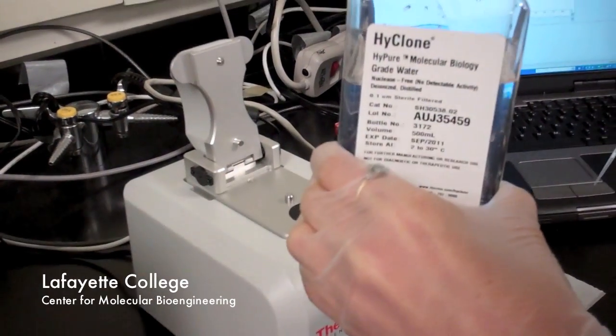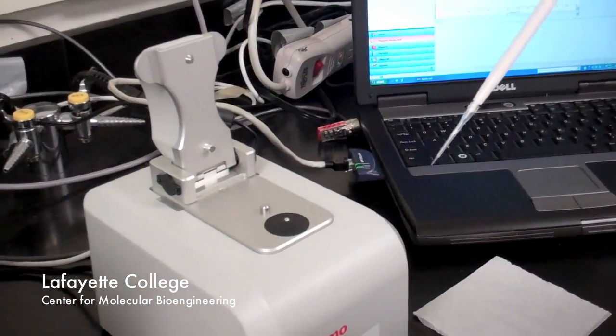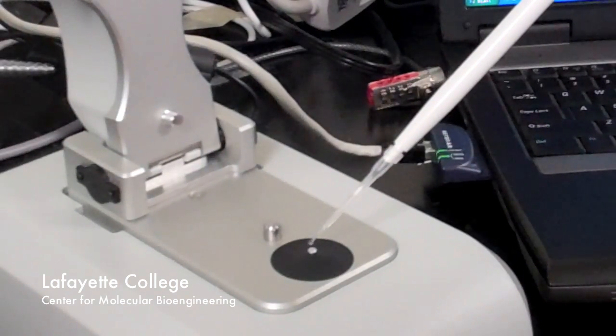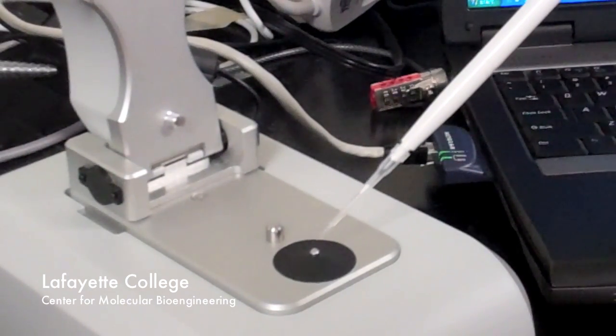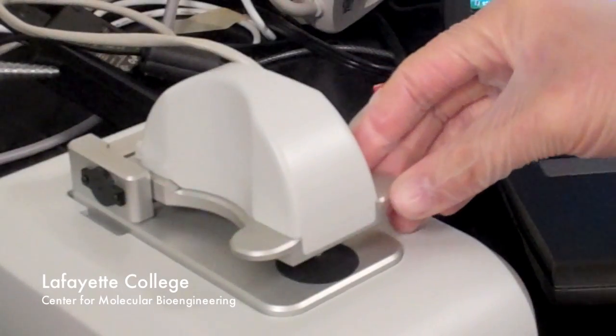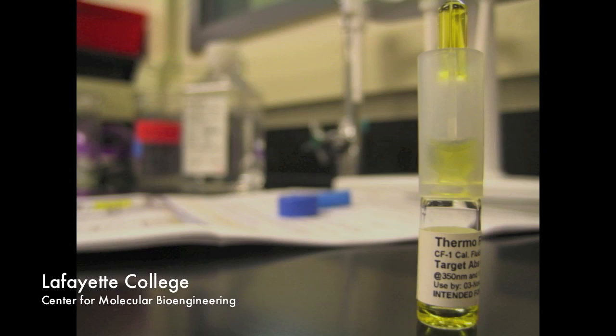If you suspect problems with the nanodrop itself, first try cleaning the pedestal. Put a large droplet, 5 microliters, on the stand and gently lower the arm. Leave the droplet for 5 minutes. Repeat this procedure once or twice. If you are still having trouble with the nanodrop, perform the calibration described in the first video, instrument and calibration. However, only do this if no other methods have worked.